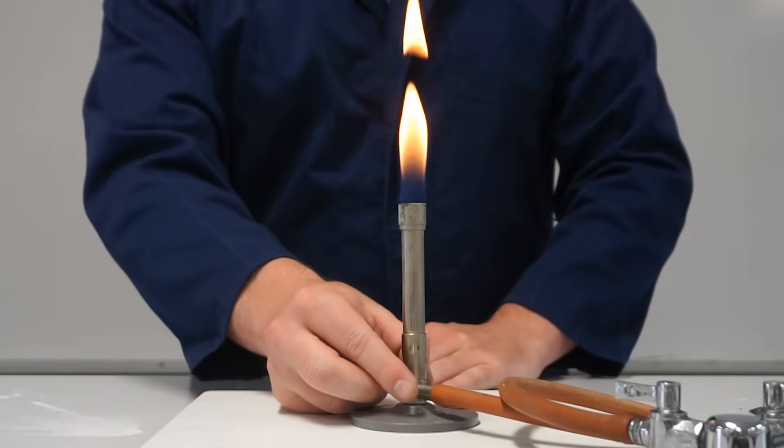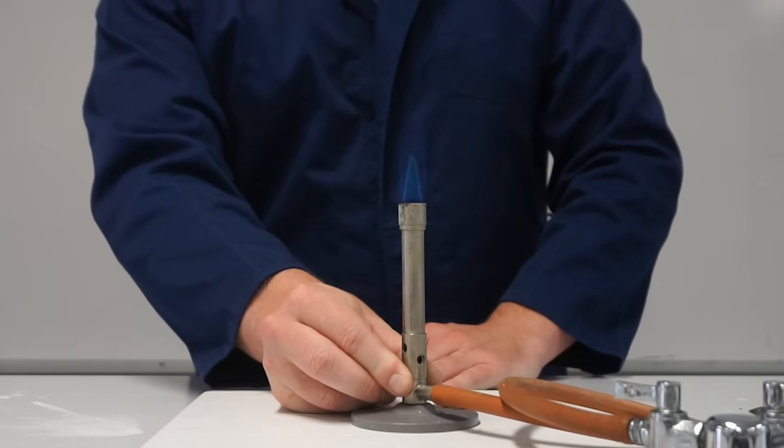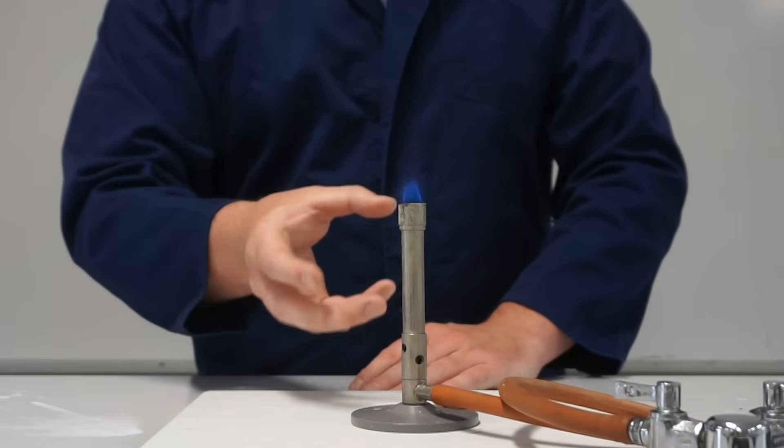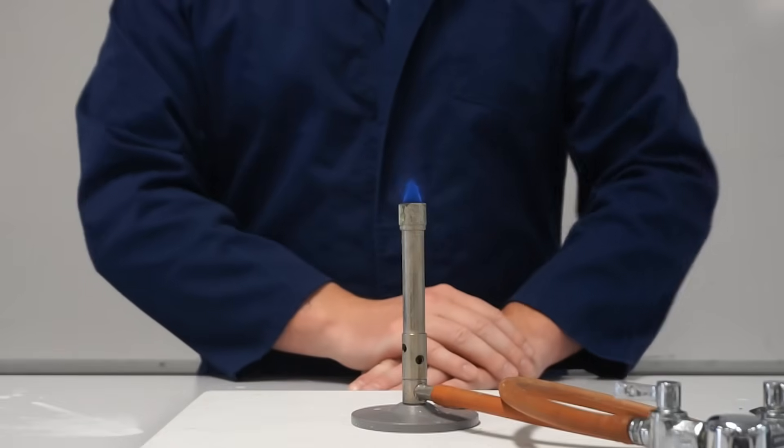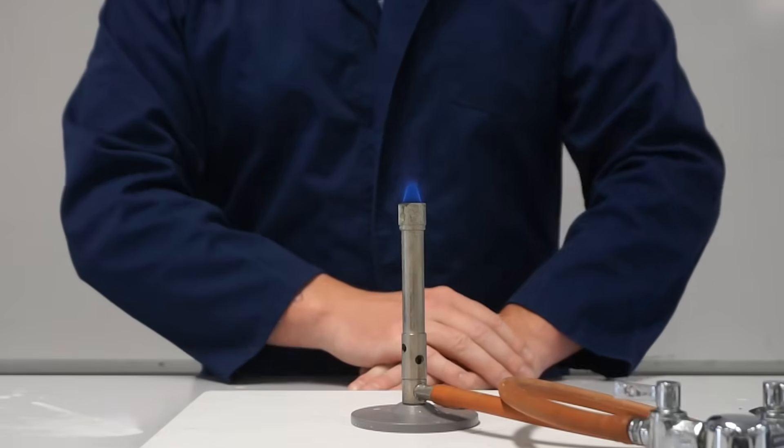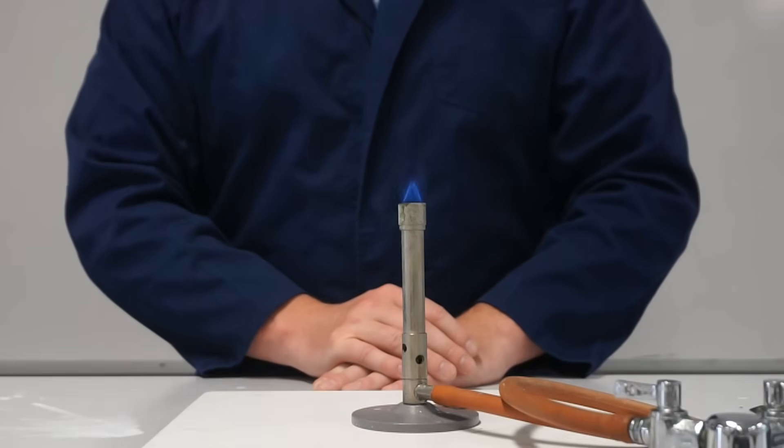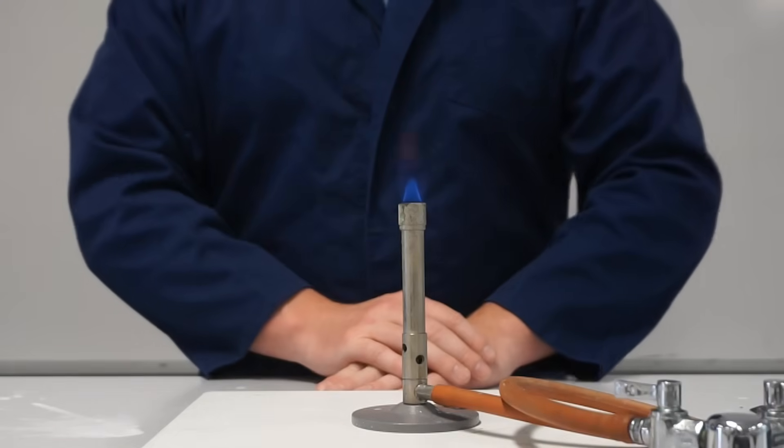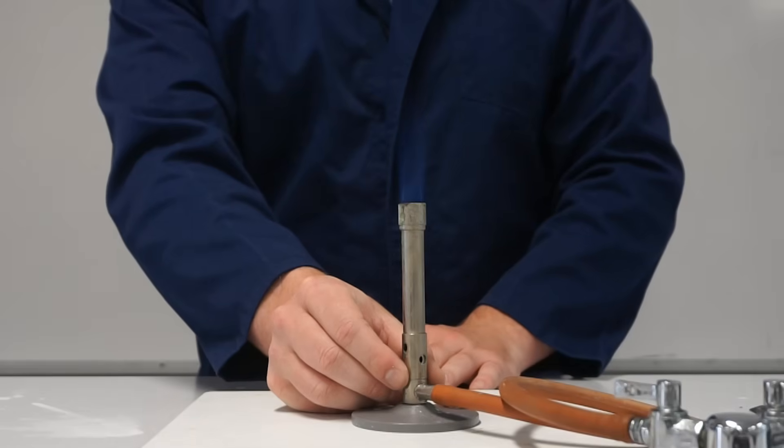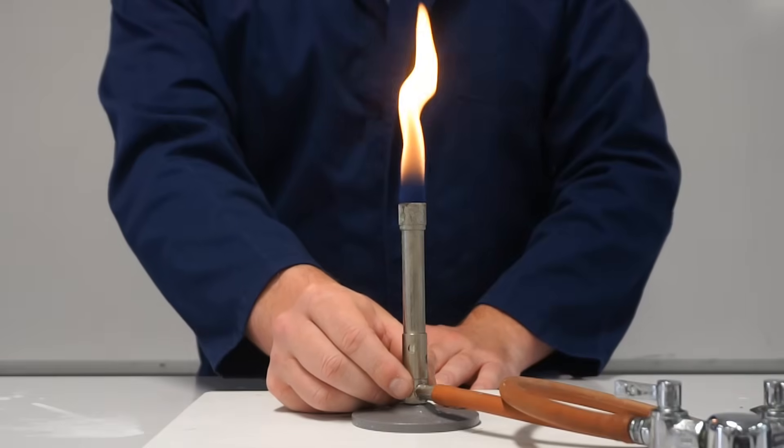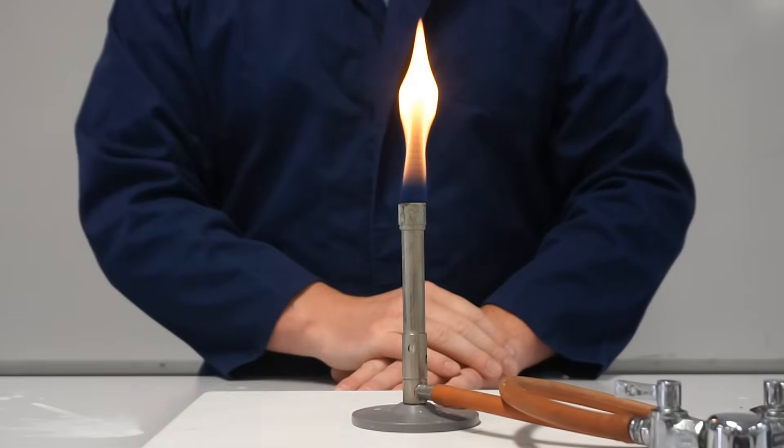I can now rotate the collar to open up the air hole and in doing so I'm allowing more oxygen into that flame and the flame gets much hotter. It's now a blue flame, barely visible blue flame and this is the flame that we would use for heating things up. Again if we want to leave the Bunsen burner unattended for whatever reason we would switch it back over to the yellow flame which is sometimes called our safety flame because it's less hot and it's much easier to see.